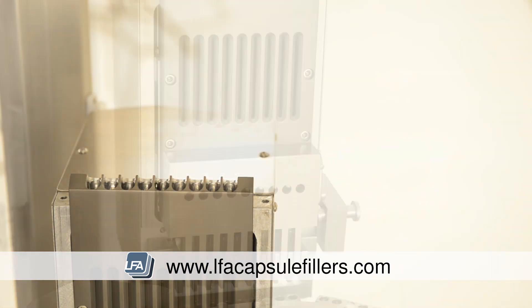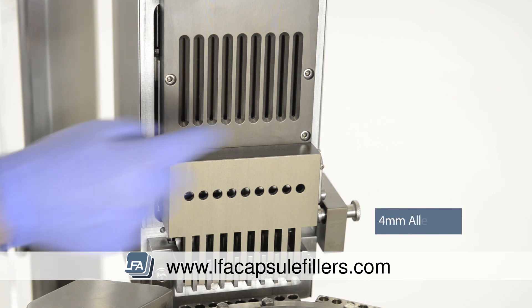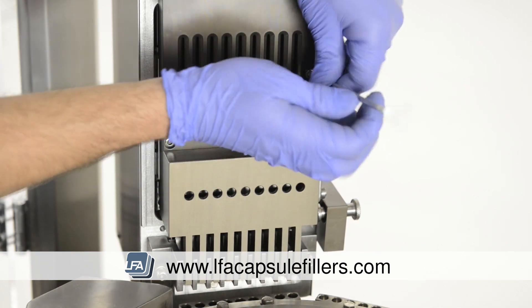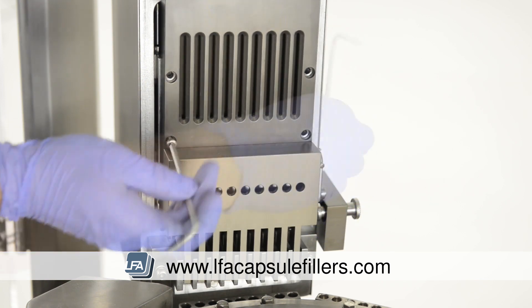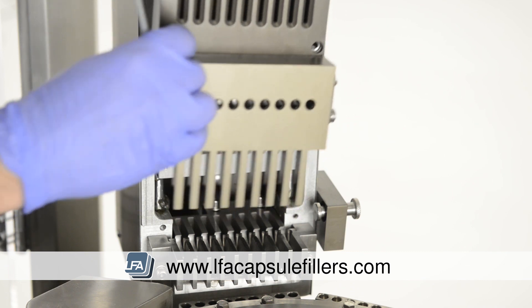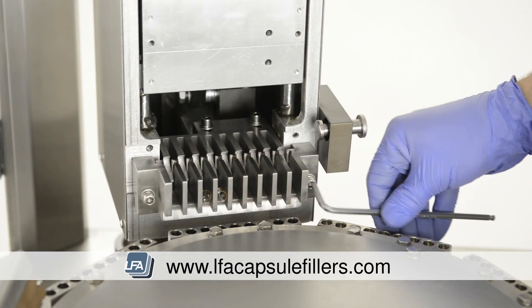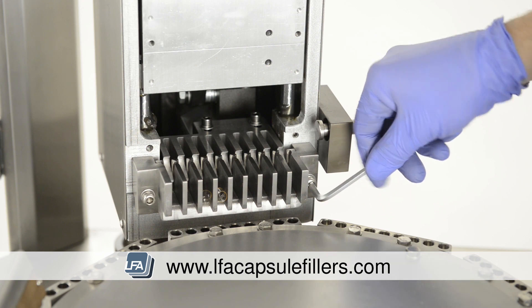Now we're going to remove the front section of the capsule sewer by removing the four allen key bolts using a 4mm allen key. As you remove this, ensure you take the weight of the front section as it will fall. Remove the two bolts at either side of the teeth section of the capsule sewer to allow you to remove it. Place it to one side.